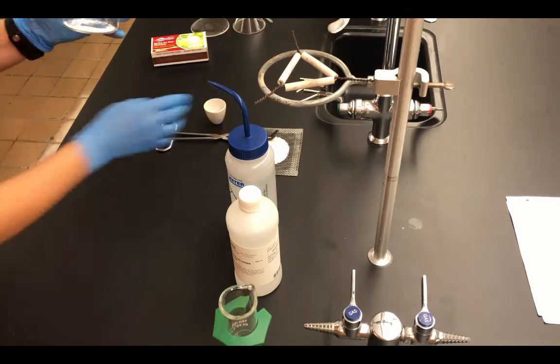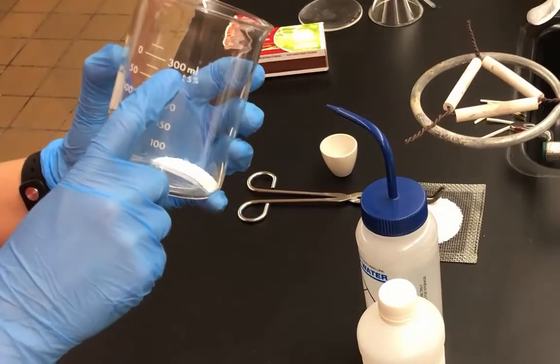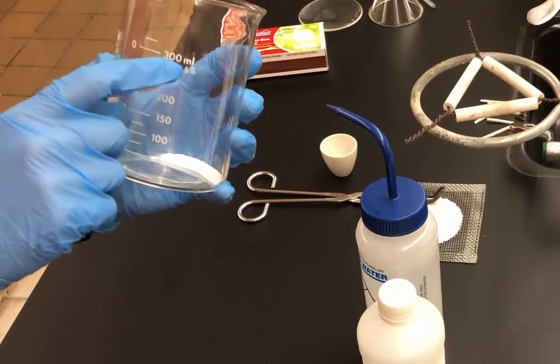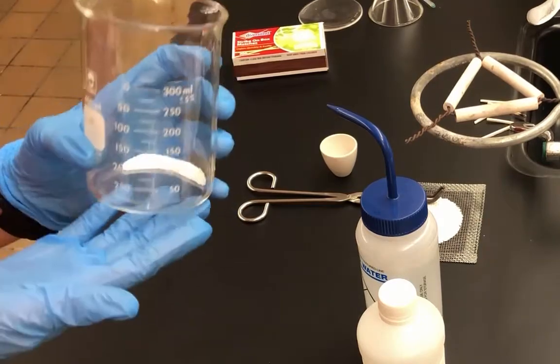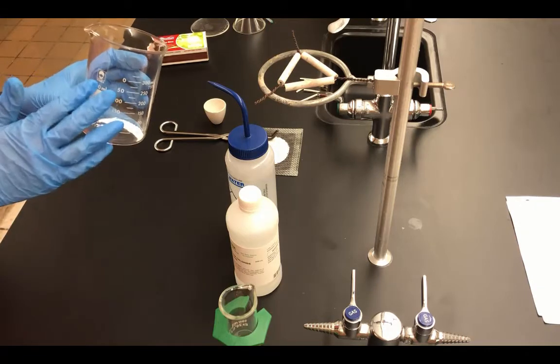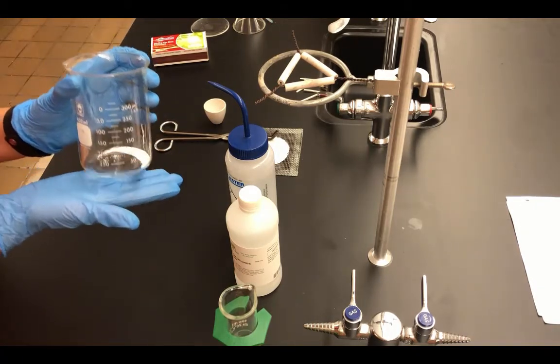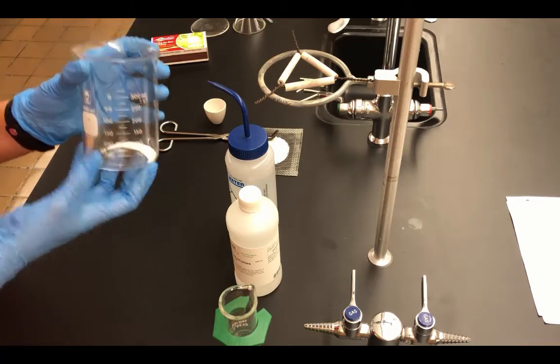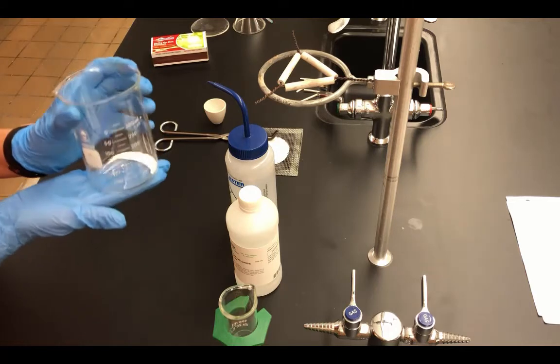So again, 400 milliliter beakers, notice how on the side it says 400 milliliters. I know it does not go all the way up, so the markings do not go up to 400, but if this were filled completely, it would hold 400 milliliters of liquid. So that's something that a lot of people will get tripped up on when they're looking at the beakers. Beakers are typically what you will conduct reactions in. So it's the reaction vessel, this or an Erlenmeyer flask.